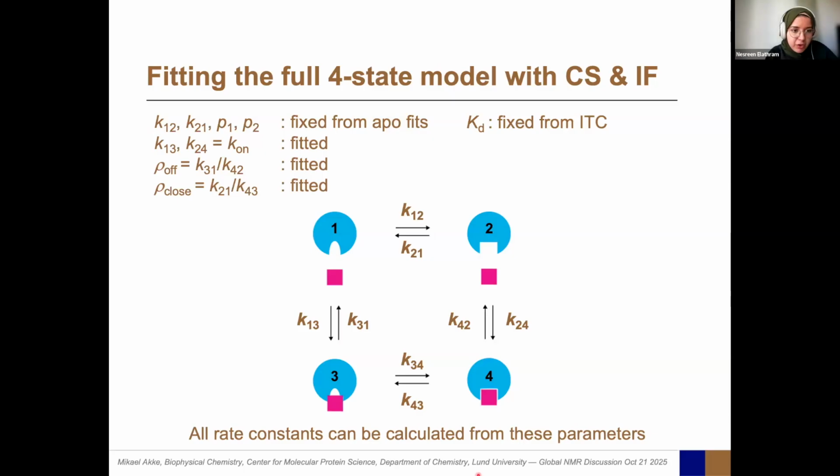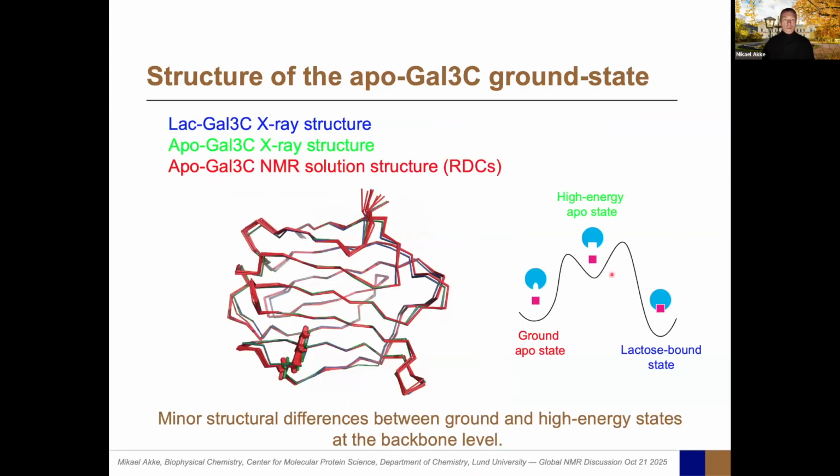Yeah, there's a follow-up. So then he said, if so, why does a small conformational change need to overcome a large energy barrier? So 34 per second seems like a relatively slow process. So it should have a high energy barrier. Yes, that's right. It does. So here, let me start with this.